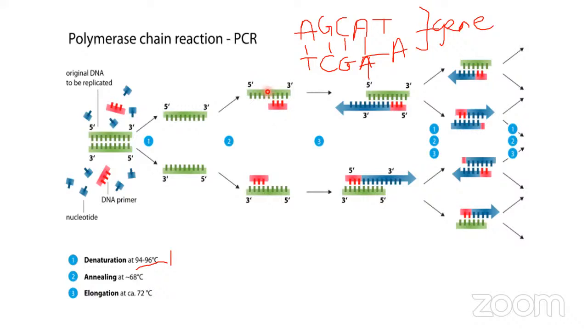When you come to the lab, I will show you a primer. It comes in the lyophilized form, and it also comes with a booklet that we use in diluting it. All right, thanks for the question. Any other one?